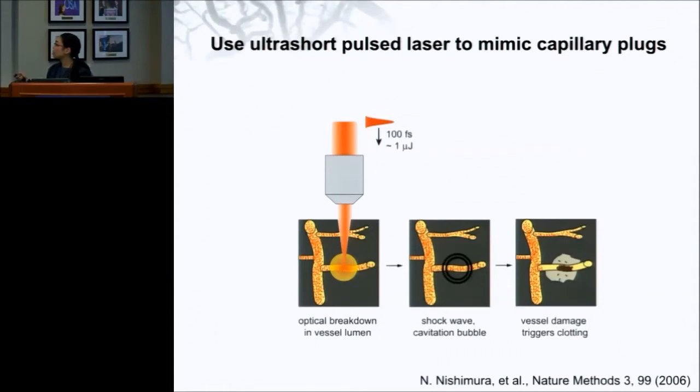Here, this is femtosecond laser ablation with an extremely high-power laser that can actually ionize material. This version of the femtosecond ultrashort pulse laser has been used a lot in electrical engineering and physics labs, and is also a basis in the telecom industry for things like trying to carry data on optical cables. But here we used some of the physics that we had learned about how these femtosecond lasers interact with material to manipulate biology to try to mimic the disease state.